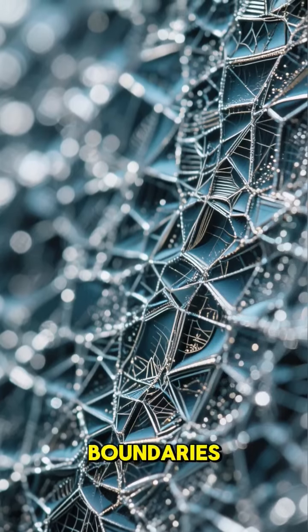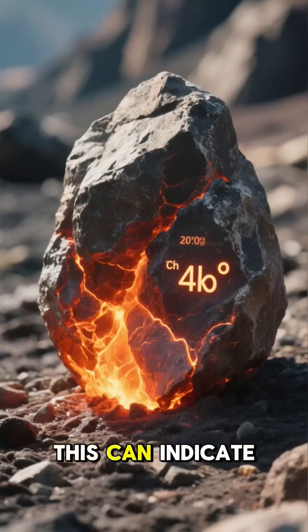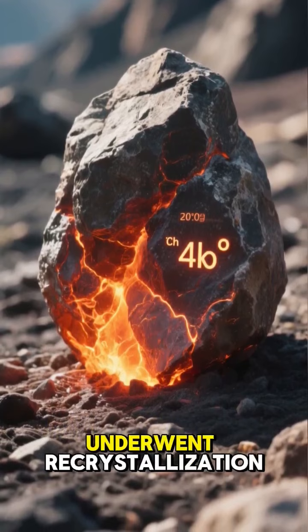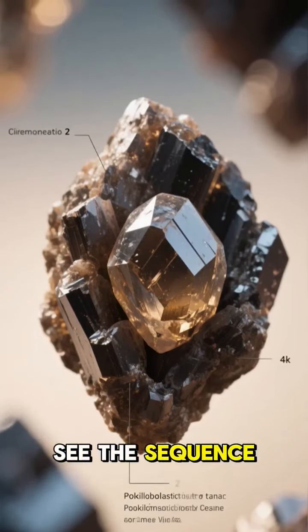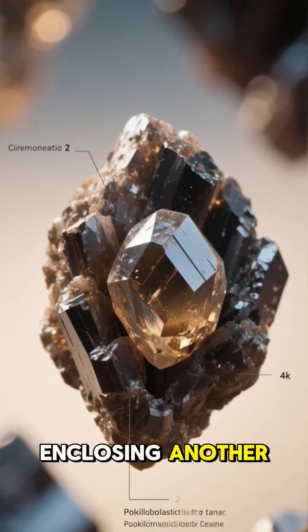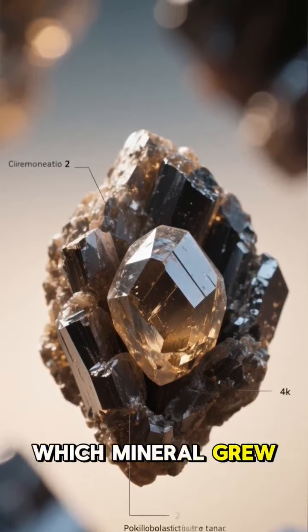Are the grain boundaries sharp and straight, or are they irregular and sutured? This can indicate whether the rock cooled quickly or slowly, or if it underwent recrystallization deep within the crust. We can even see the sequence of events. Sometimes you'll find one mineral enclosing another, what we call a poikiloblastic texture. This tells you which mineral grew first.